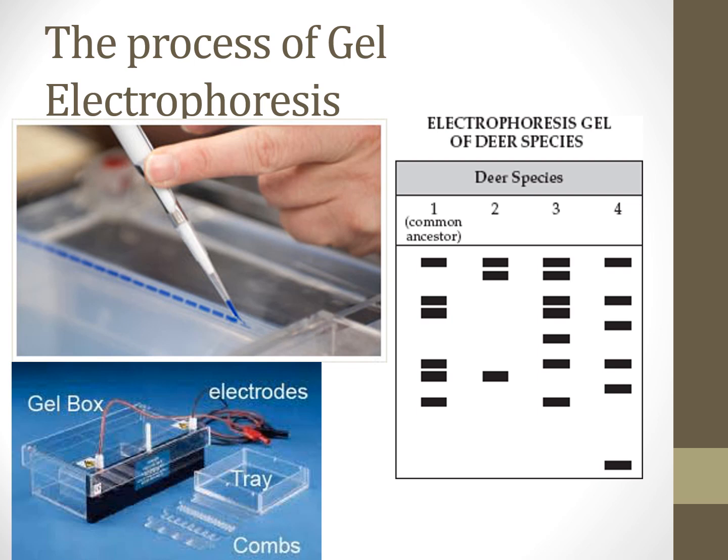In our exams, you might be given a situation that looks like this where you would need to analyse the banding patterns and comment on whether or not an organism is related to other organisms that are found inside that well.